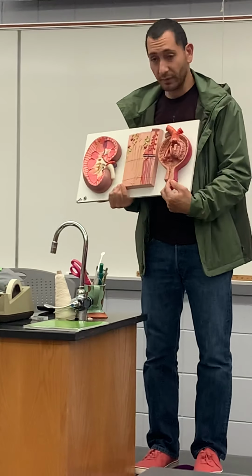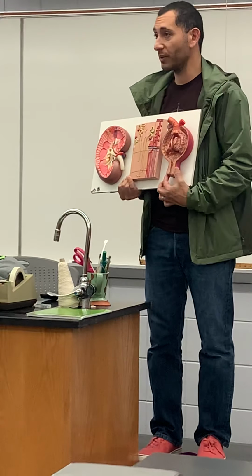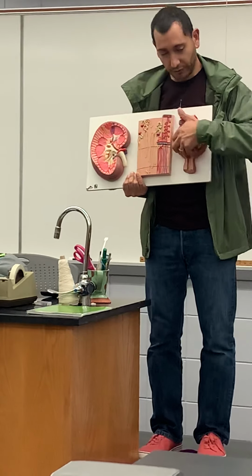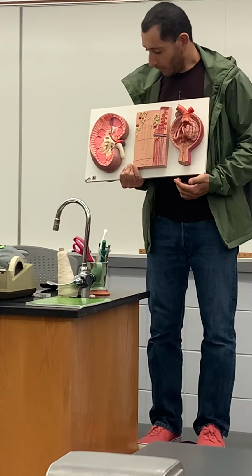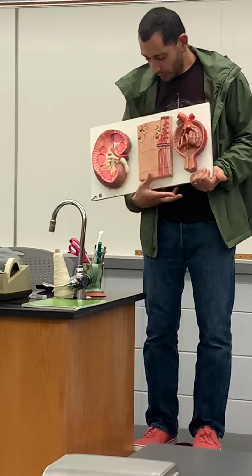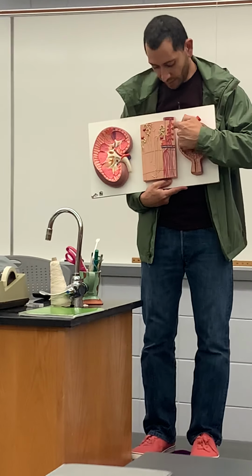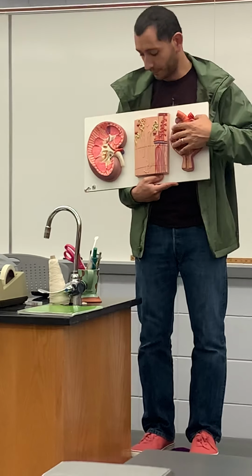And this is the beginning of the PCT. Here's the filter, the filter would be in here. These little tomatoes here, these are the renal corpuscle.